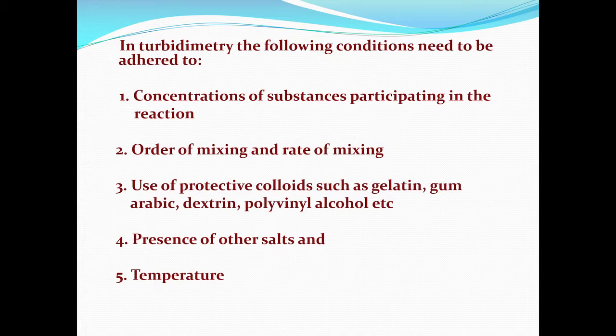Sometimes we take metals, then add buffer, then add reagent, and then a stabilizing agent to keep the small particles in suspension. Now, the order of mixing can change.